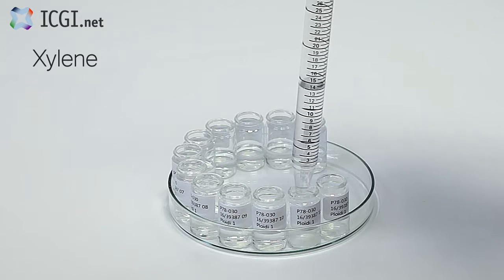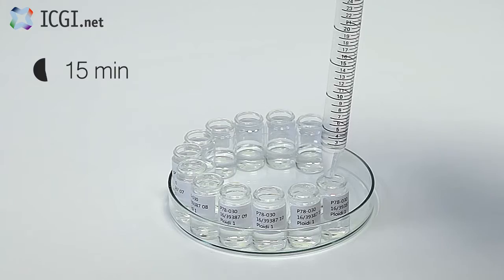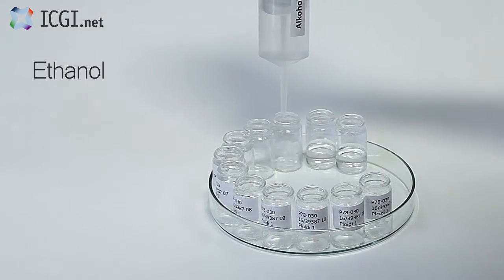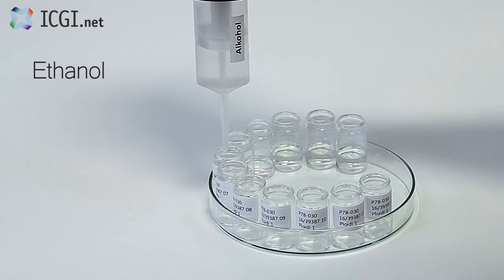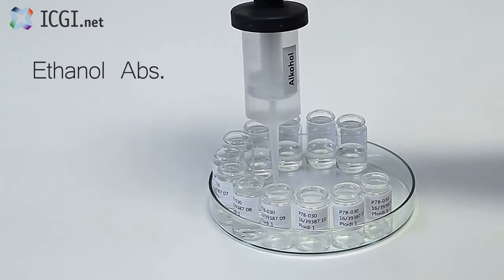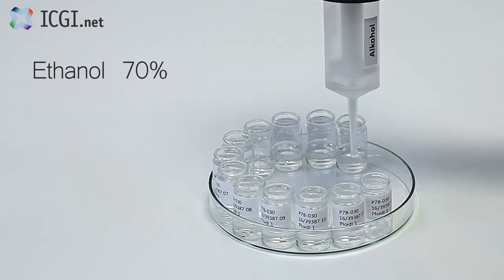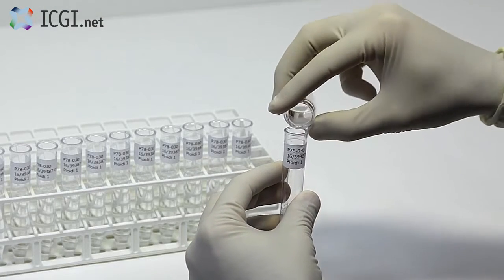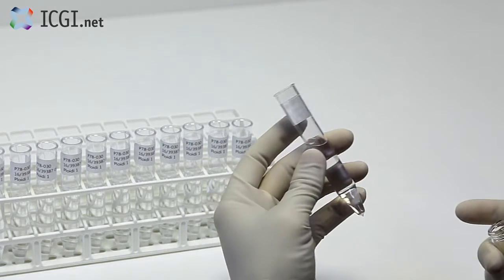Preparation of the tissue sections begins with 15 minutes of deparaffinization using xylene. This is done twice. After discarding the xylene, the tissue sections are washed and rehydrated with a series of decreasing ethanol concentration: absolute, 96%, 70%, and 50%. During the rehydration process, the tissue sections are transferred to conical centrifugal tubes.